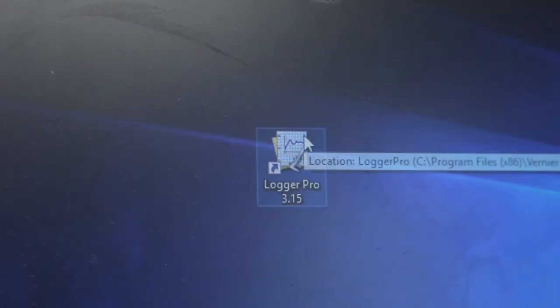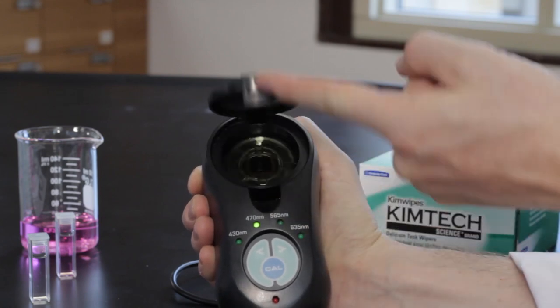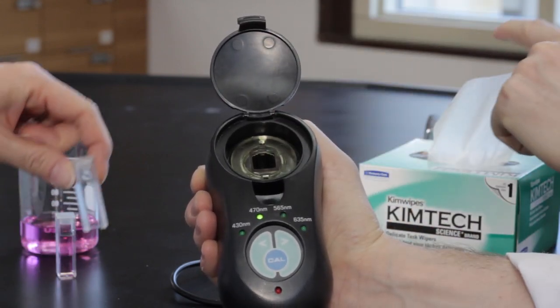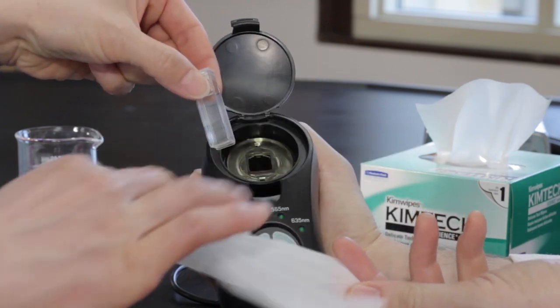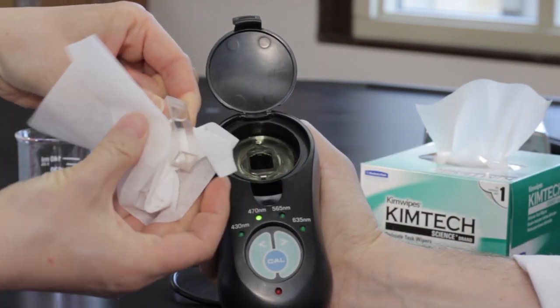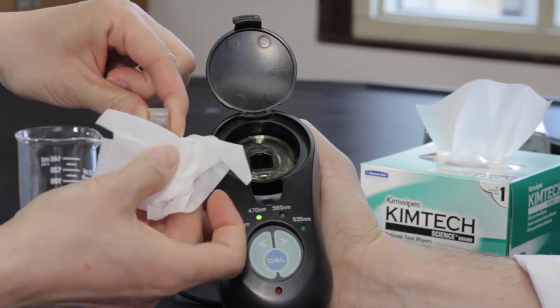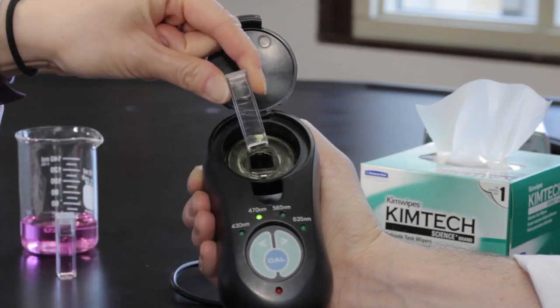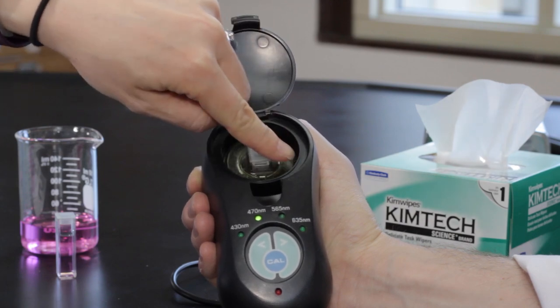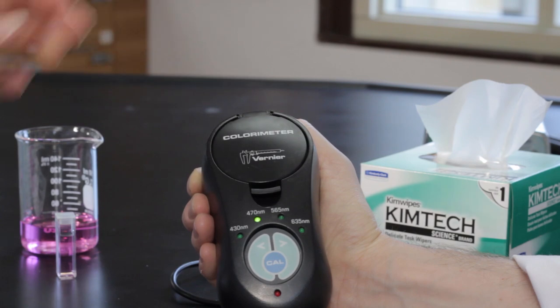Open the LoggerPro program and the appropriate file for the experiment. The colorimeter must now be calibrated. Wipe the cuvette containing the reference solution, which was distilled water, with Kimwipe and place it in the cell wall of the colorimeter. The cuvette must be clean and dry. Make sure to position the cuvette so that one of its clear faces is directed toward the white reference mark. Close the cell wall.